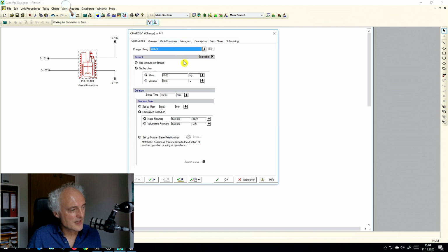So you see, each operation has many things you can play around with. We just concentrate now on the basics, yeah? So that you have an idea how to set it up. This is why we keep this process simple. But you see, you can do tons of different things in each operation. So we are in a vessel, in the operation, and you can do hundreds of things. So you see that there is a lot of complexity behind. And our job now is to bring down this complexity to a level that it's possible to understand it.